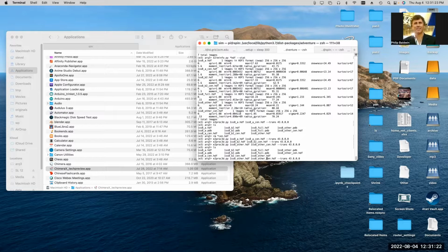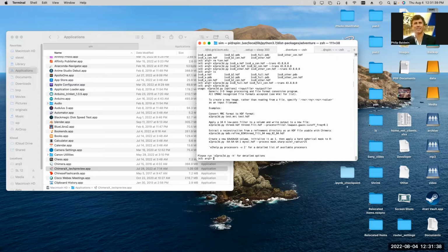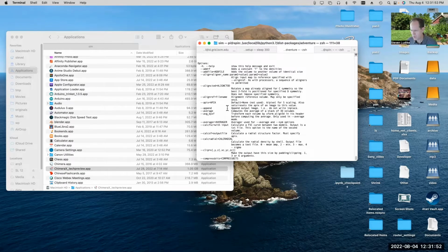Yeah, let me do the full one too, just to show the alignment thing. All right, so, let's see.